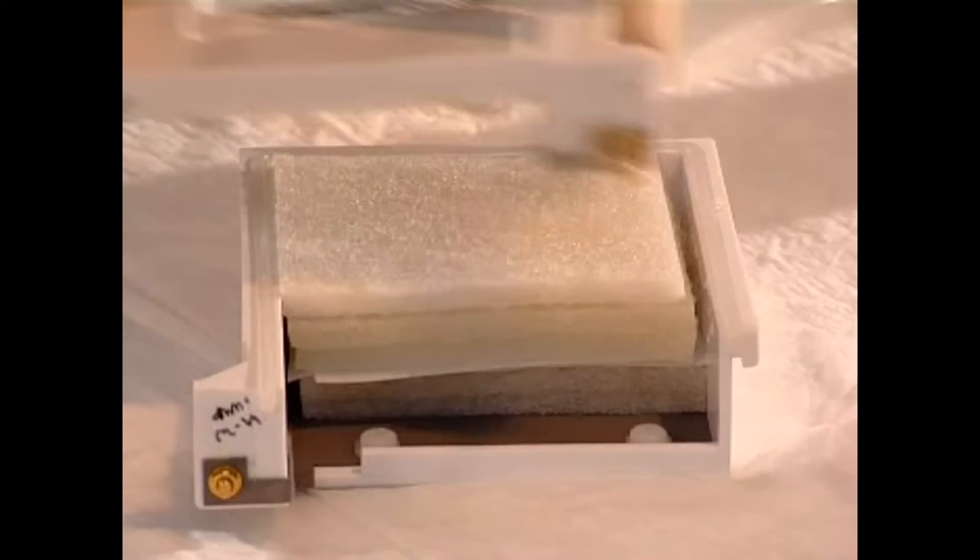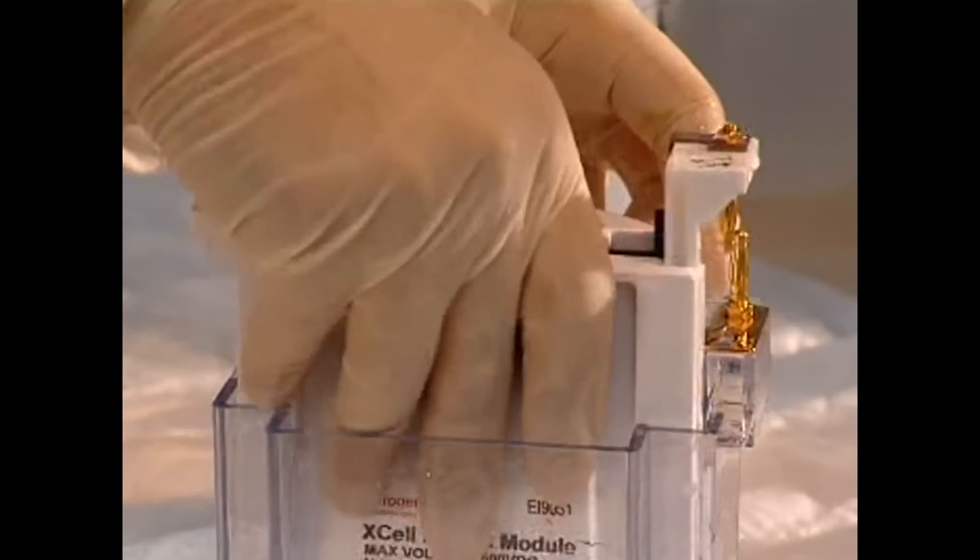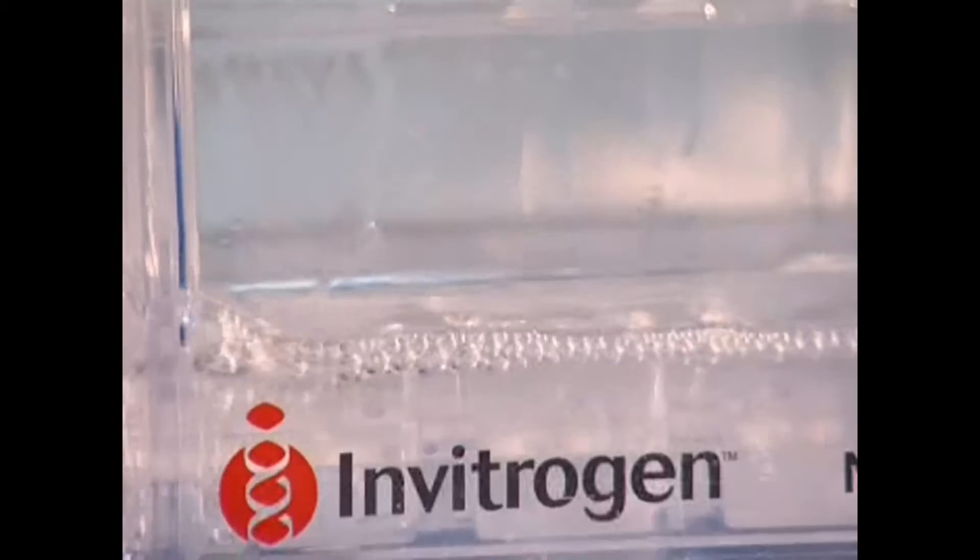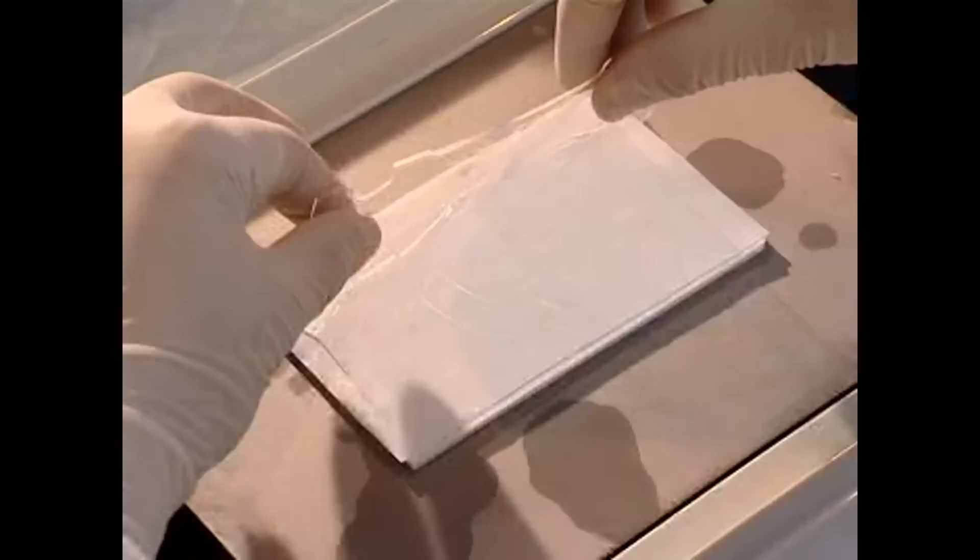Western blotting is a central pillar in today's life science research, but protein transfer to membranes followed by blocking and detection takes long hours to complete.